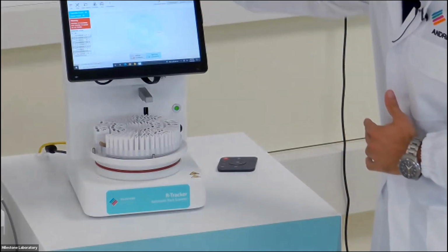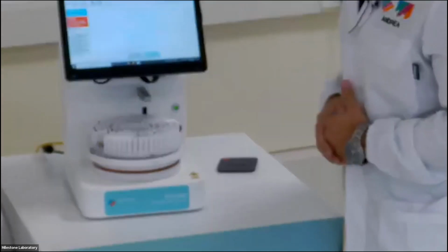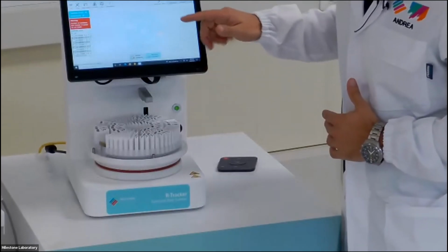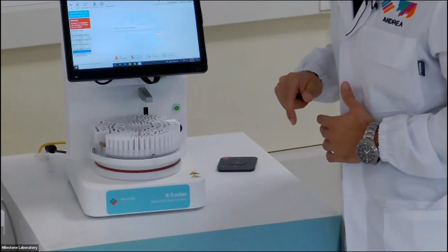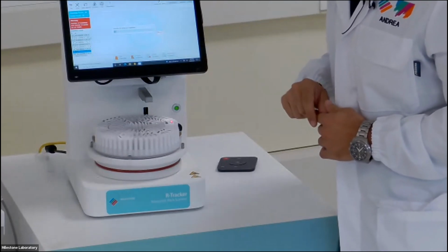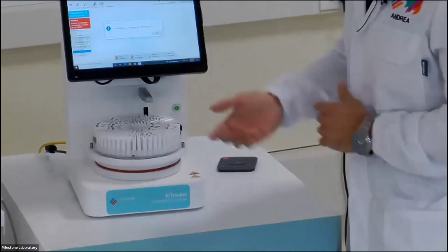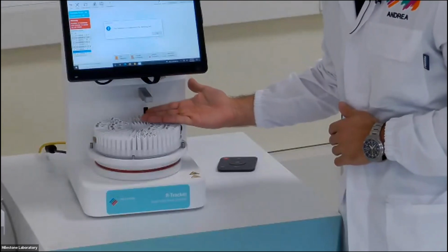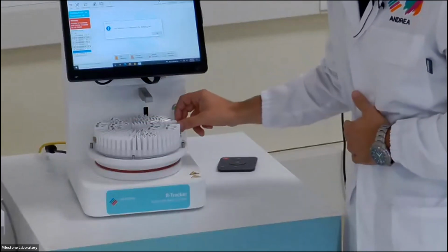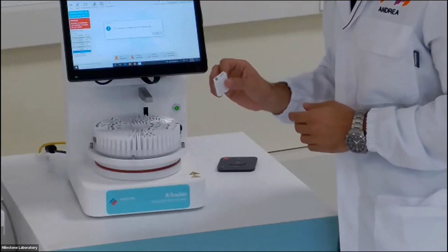And now I have a problem. There's one cassette that's not readable. So this is the answer. And I can locate the cassette. If I locate it, the R tracker tells me where the cassette is in order to identify it. So under the blinking laser light, there's my cassette, turned upside down.